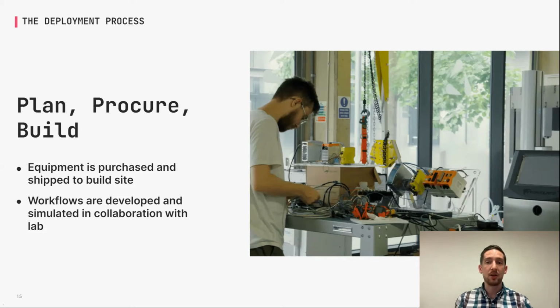We're also going to work on planning things out on the software level. So really using that flow chart or that workflow map and starting to put that into the software and developing a schedule of what the process is going to look like. Start simulating that if it wasn't already done in the pre-sales process, and basically collaborate with the lab to make sure that everything looks as planned and the assay in the software is mapping up with how you're currently performing it.